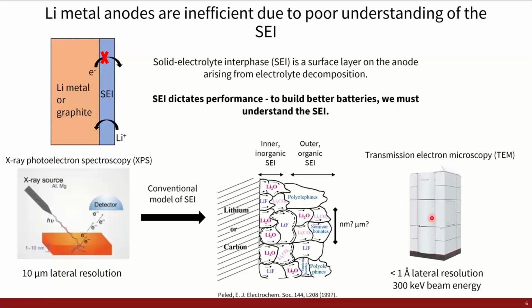The effect of the microscope accelerating voltage on the degree of beam damage to the sample is quite complicated. Ray Egerton has a few review papers on this topic, but basically going to lower kV does not always monotonically decrease the amount of beam damage.